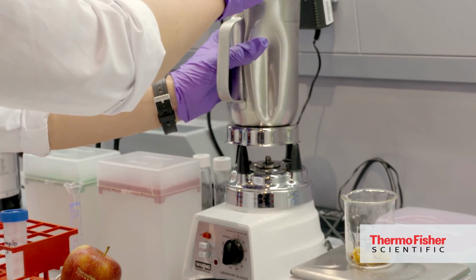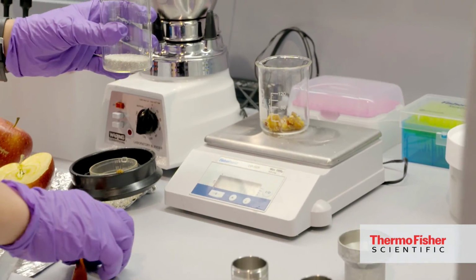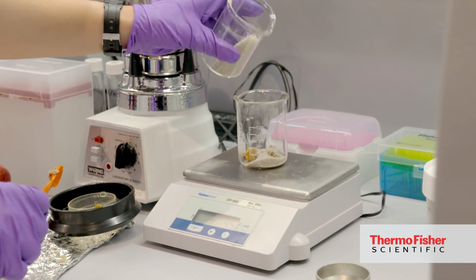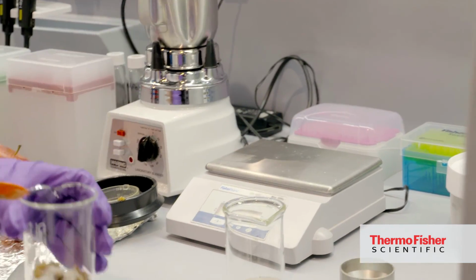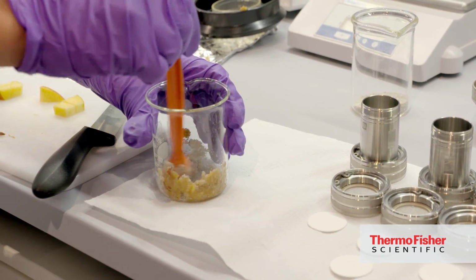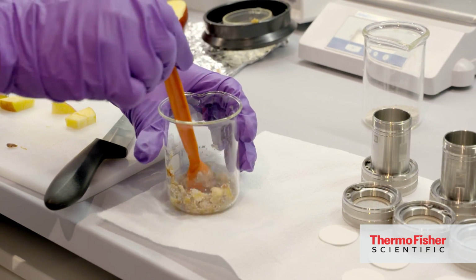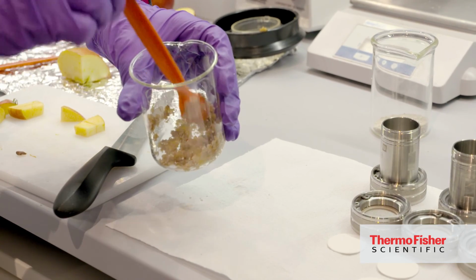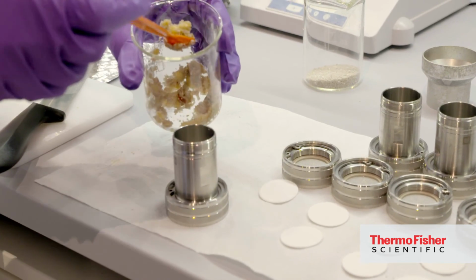And for the accelerated solvent extraction, we need dispersant. This has to be added right now in a ratio of more or less 4 sample units to 1 dispersant unit. This is what was done. This has to be mixed, carefully mixed, so that it's more or less homogeneous. And whenever it is, then it is simply put into the cells, the extraction cells.